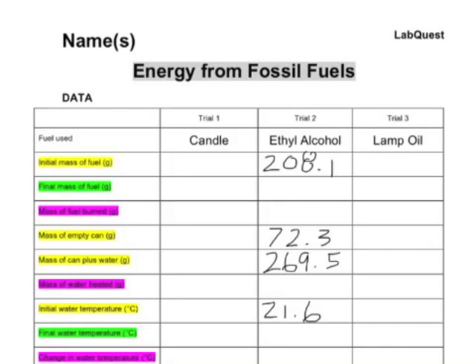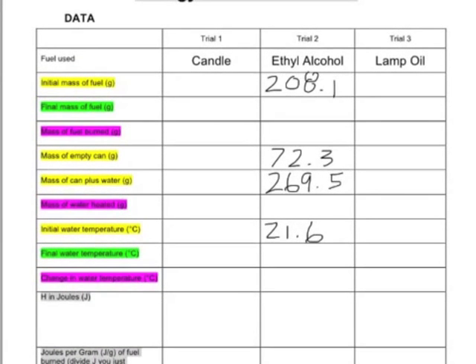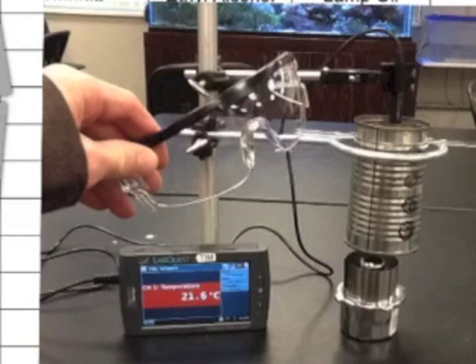You can see I color-coded this data table. When you've filled out all of the categories in yellow, that's the stuff you need to get before you start the burn. Make sure to put on some safety glasses.